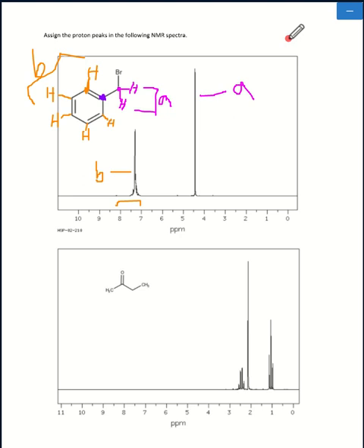Now, there is something that we didn't really get into in this first spectra, but there is something called the N+1 rule when it comes to NMR. Essentially, the N+1 rule will tell you how many times a particular environment will break off into sub-peaks. And the rule is basically the number of neighboring hydrogens plus 1.